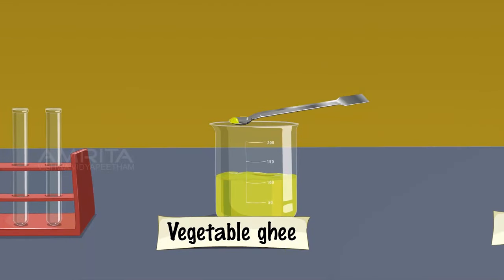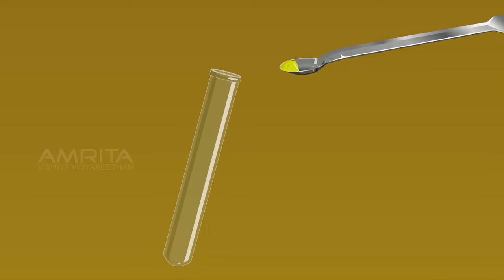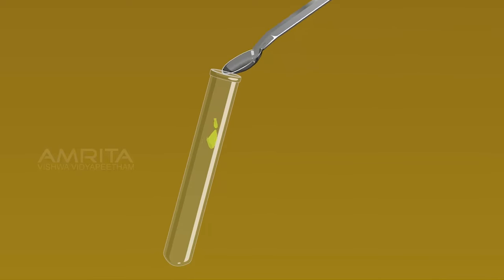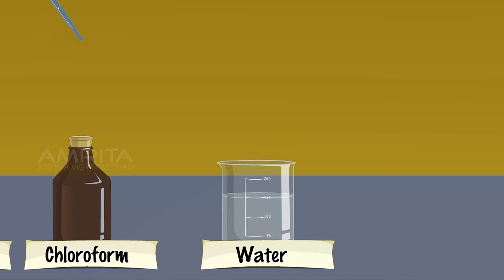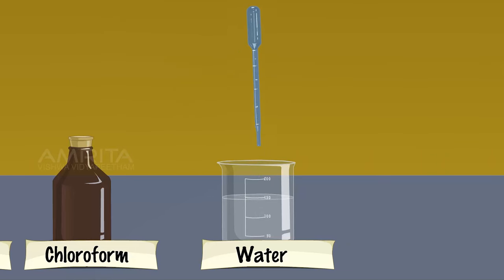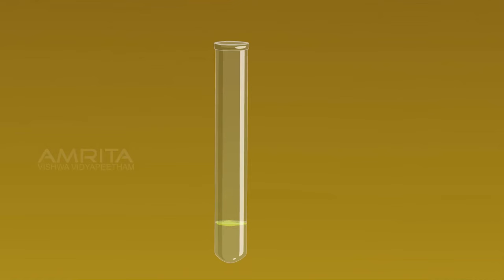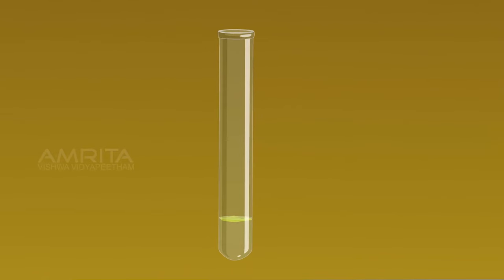Vegetable Ghee. Using a spatula, take a small amount of vegetable ghee in a test tube. Using a dropper, take about 5 ml of water and add it into the test tube containing vegetable ghee. Vegetable ghee is immiscible, i.e., not mixable in water.